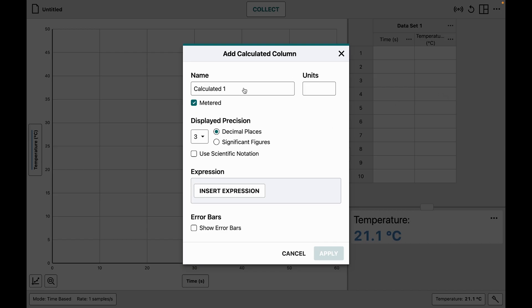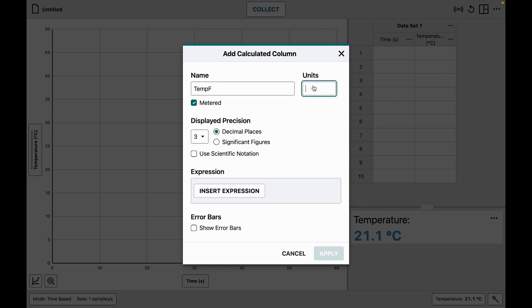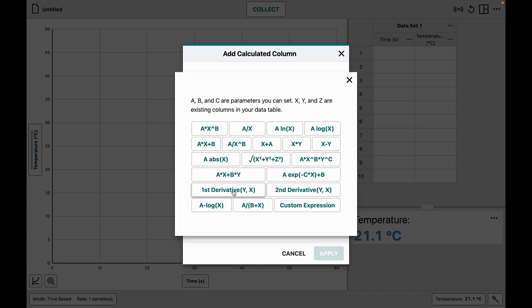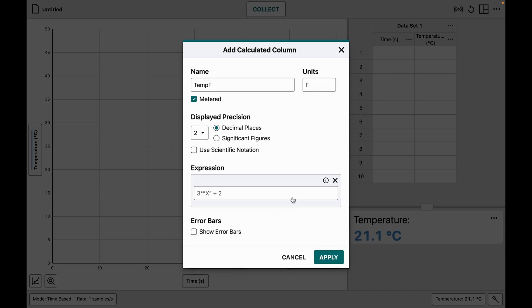I can set up my column to be Temp Fahrenheit, add the Fahrenheit label, stick to two decimal places, and then insert an expression. I'm going to choose the custom expression option.